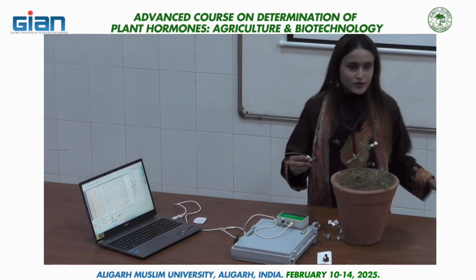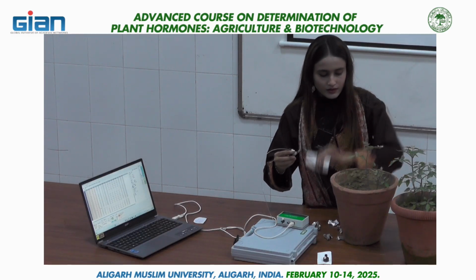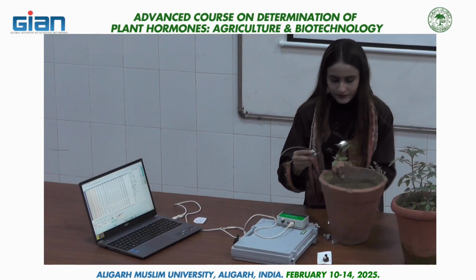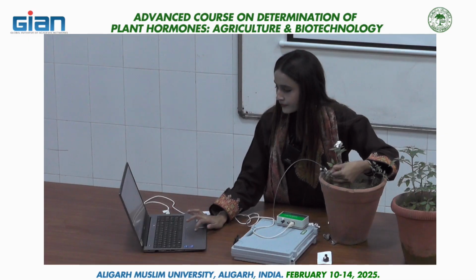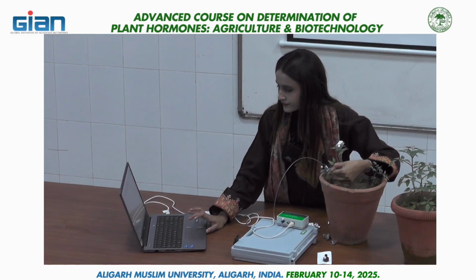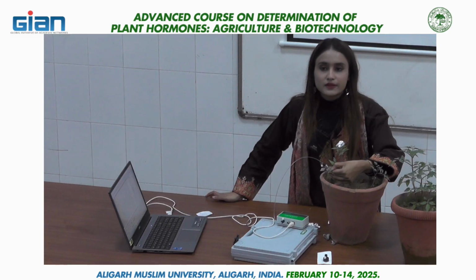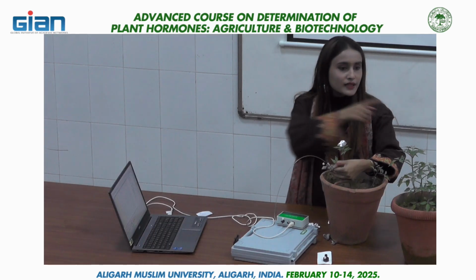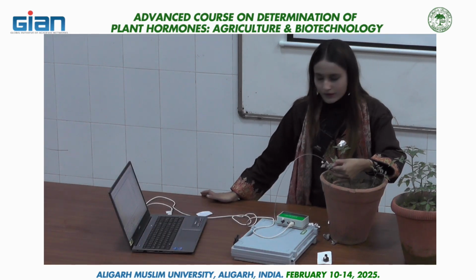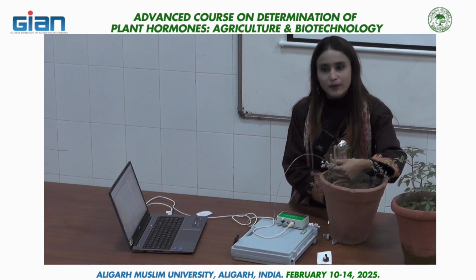As you can see, the morphology of this plant is already affected. Here we are getting a reading of 0.277. Obviously, Fv/Fm is lower than in the hormone treated plant. So you can compare here that Fv/Fm declined in stress treated plants.